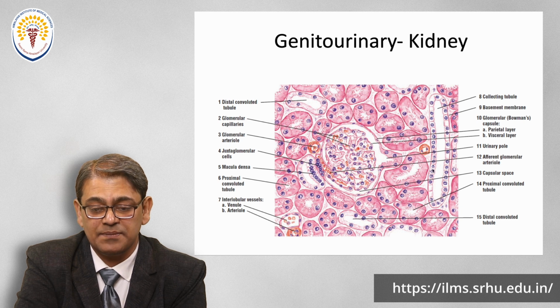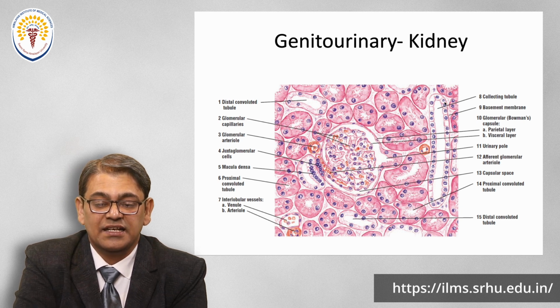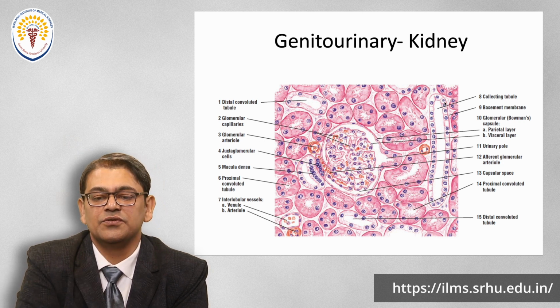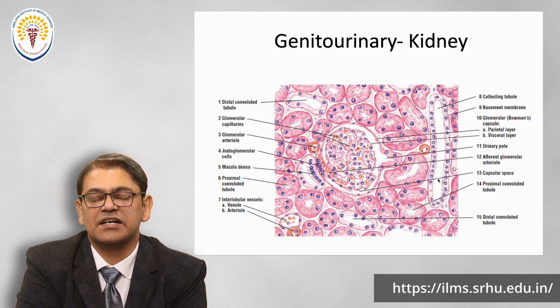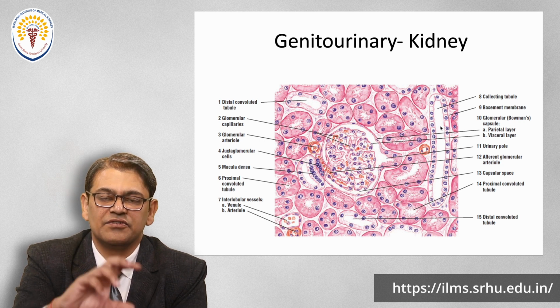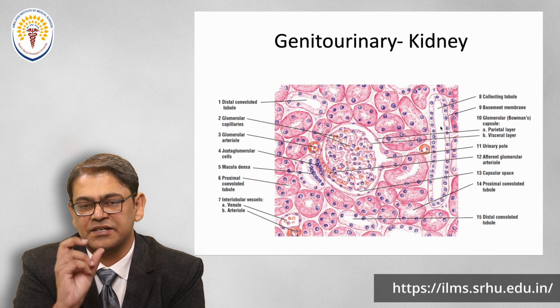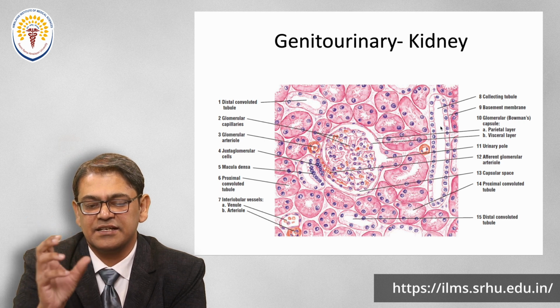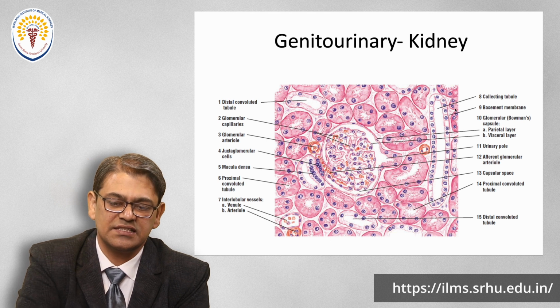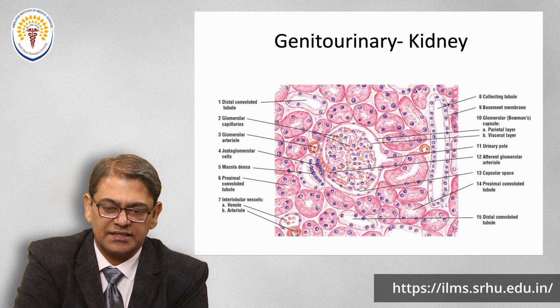Now here we see the bigger channel. It is the vertical section of a tube, and this one is named as the collecting duct. So this is the collecting duct. If you remember the anatomy of the nephron, the collecting duct is the area where all the filtered structure ultimately drains into. So this is the structure of the collecting duct.